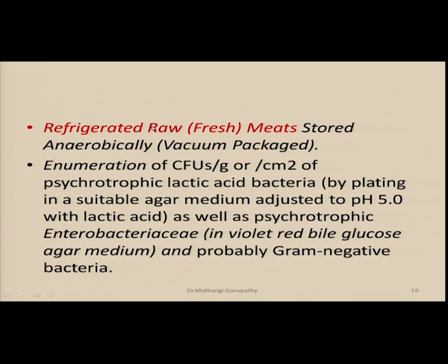When the same refrigerated raw or fresh meat is stored anaerobically, vacuum packaged, here again we are going to look for the presence of psychrotrophic lactic acid bacteria.